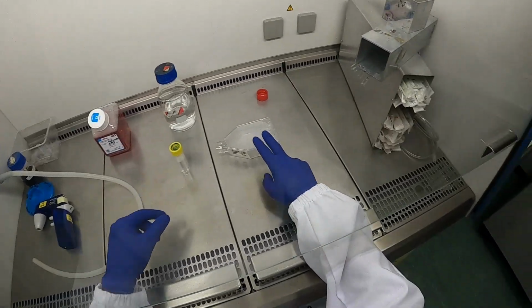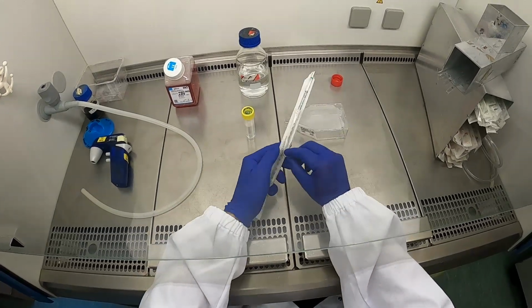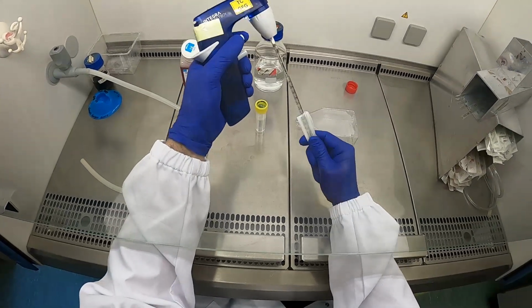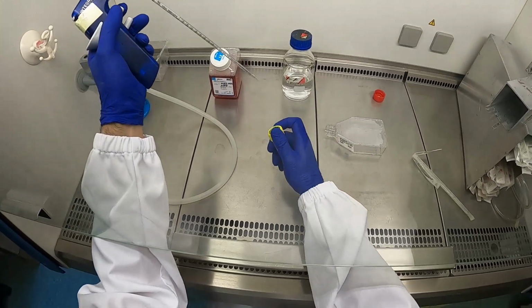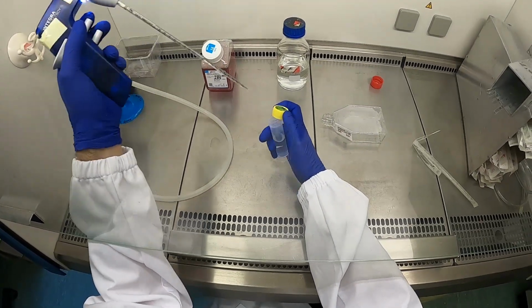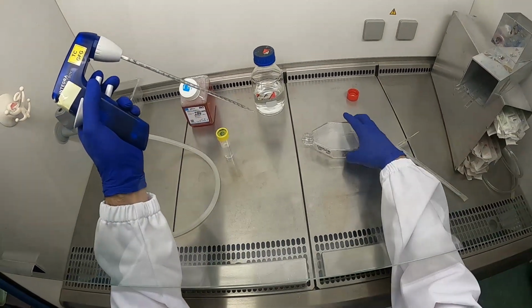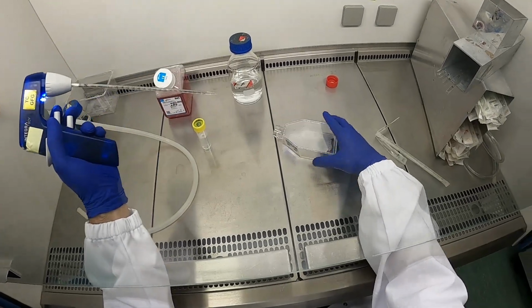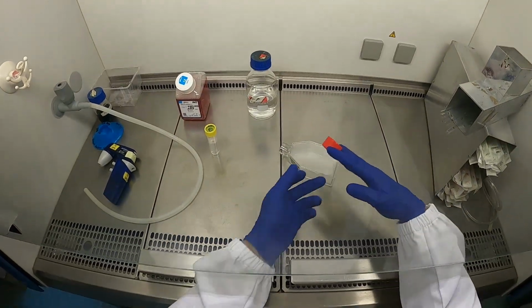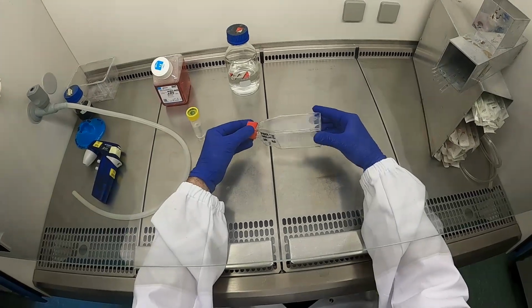So now we take the trypsin. We take a smaller pipette, 2 ml. Again, take it carefully out of the package. It's sterile. We have to keep it sterile. Remove the cap. Take roughly 1 ml, sort of halfway in this 2 ml pipette, and introduce this into the flask. Get rid of the pipette. Close the flask and carefully move the trypsin over the cells.